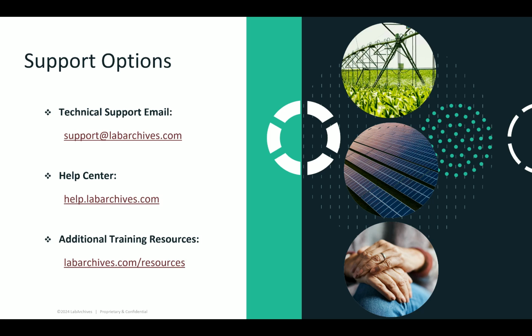If you have questions about any LabArchives tool, please get in contact with us. You can email our support team at support@labarchives.com, review our help center at help.labarchives.com, or check out some of our other resources on our resources page.